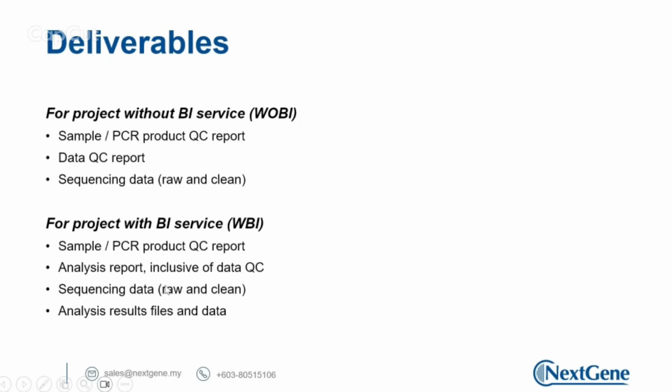We received some queries on whether we will be providing the sequencing data after the project. Yes, we will be providing the sequencing data, raw data and clean data, for all the projects. So no worries that we will keep your data as hostage. Once you have the metagenomics sequencing projects, you will be receiving the sequencing data, raw and clean.